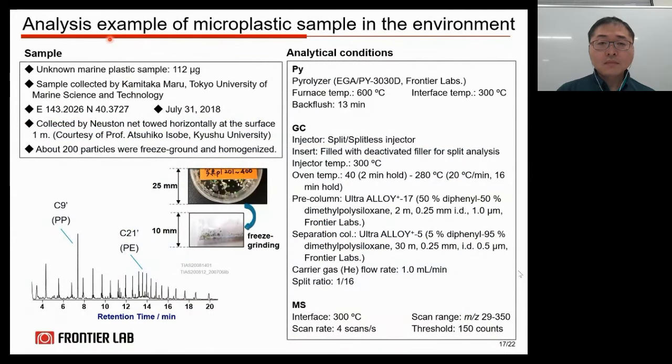This is an example of the analysis of a microplastics sample in the environment. We analyzed unknown marine plastic samples collected off the coast of Japan. The sample was provided by Professor Isobe at Kyushu University.